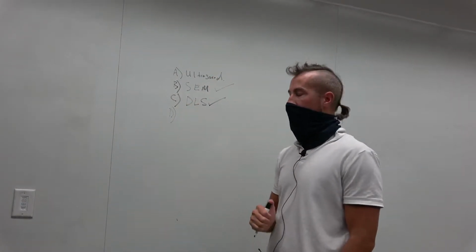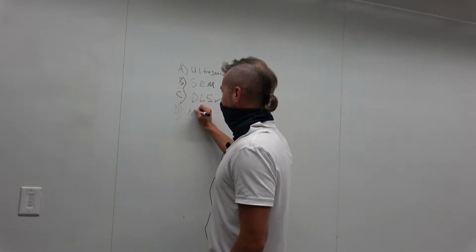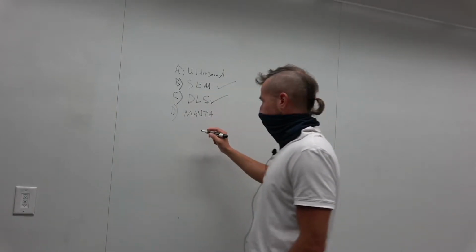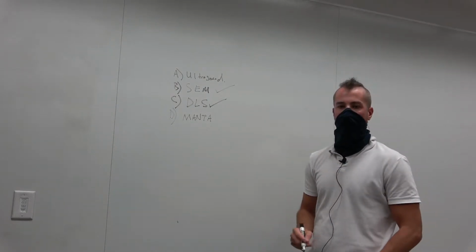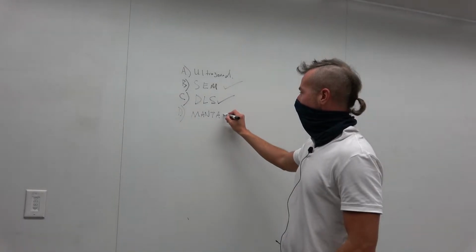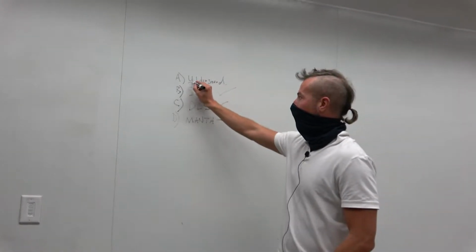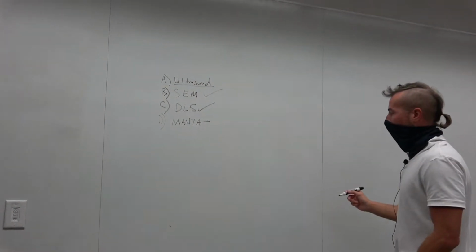There's 4 steps to this, is an additional type of analysis known as multi-wavelength nanoparticle tracking analysis, or MANTA. And so we're going to come to this later in day 2, but for now we're going to focus on the ultrasound imaging. Okay, so let's just talk a little bit more.